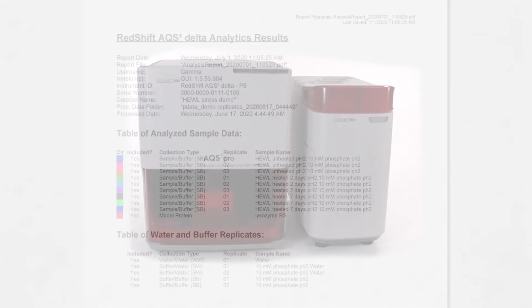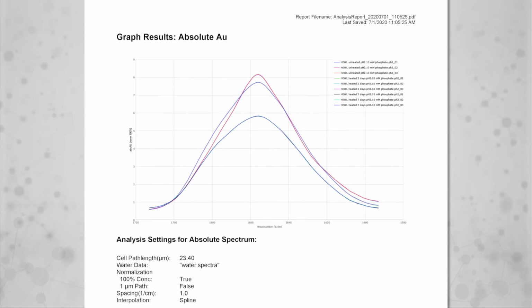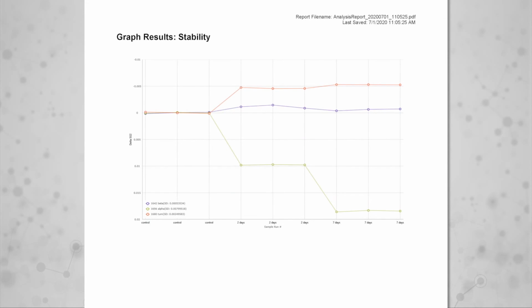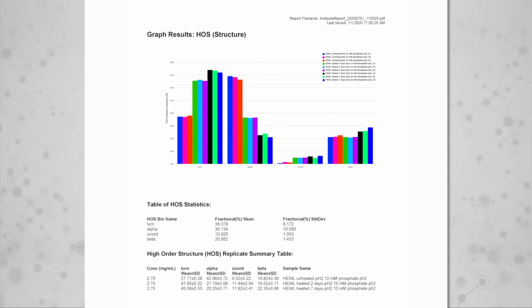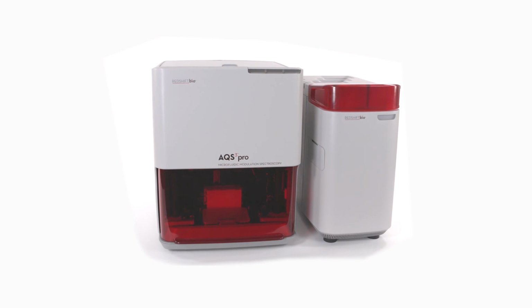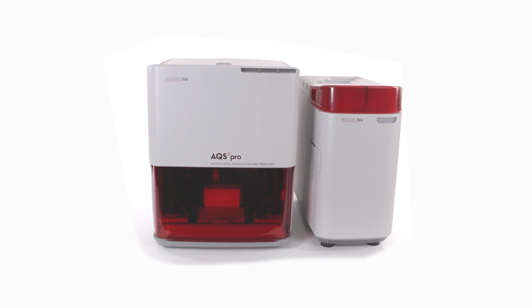The improvements in data quality with the AQS3pro allow for analysis of proteins over the widest concentration range. This allows for analysis without buffer interference and yields repeatability around 98%, giving confidence in the data quality and ability to observe small changes. Finally, the AQS3pro de-risks drug development due to the increases in data quality, allowing confident, accurate, and timely decision-making.